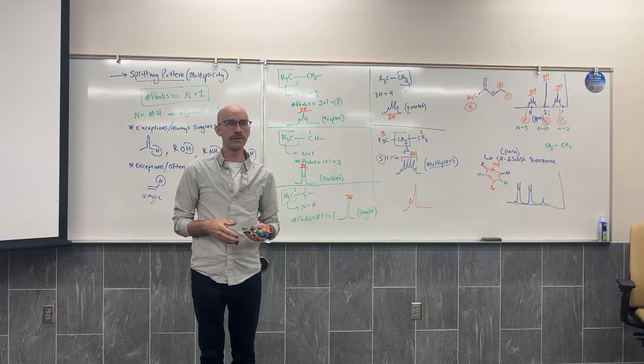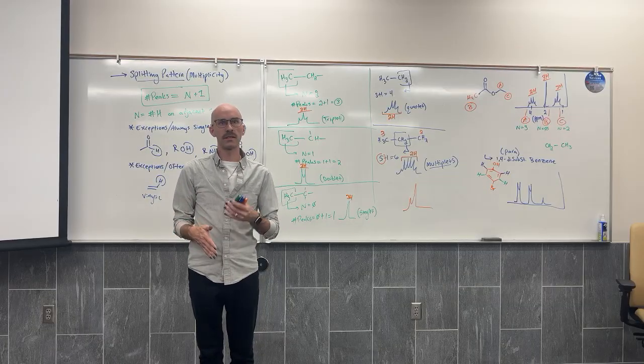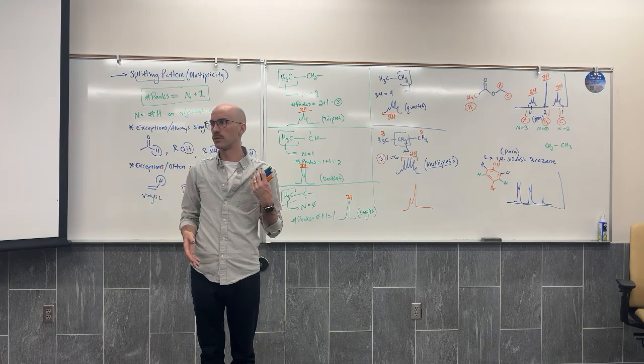So those two signals get split into doublets and become integrated as 2,2.